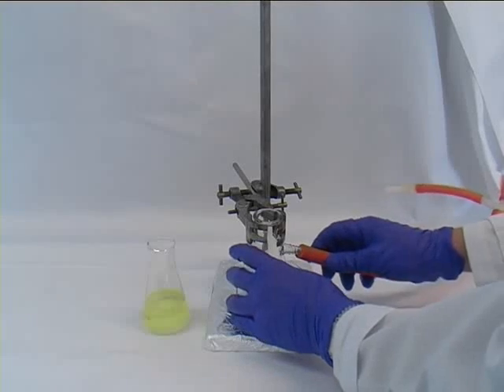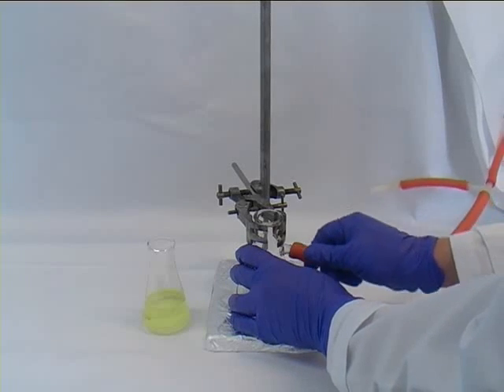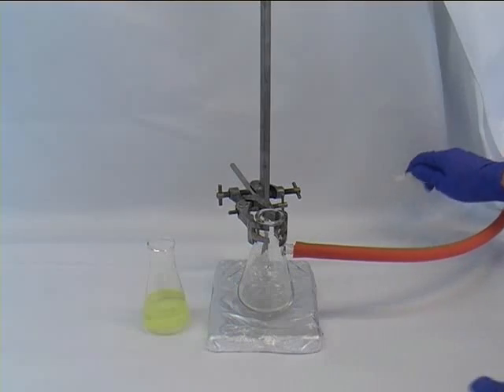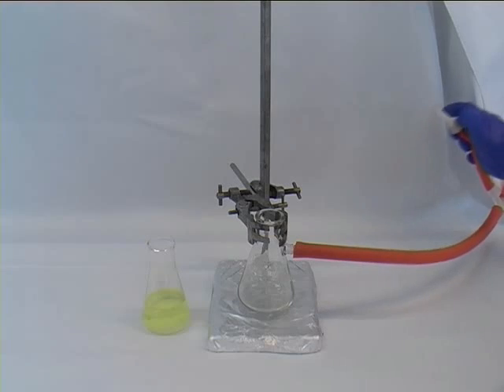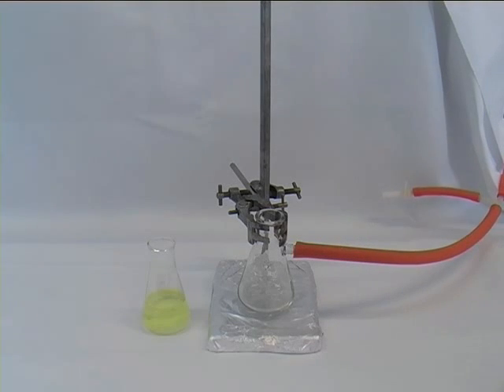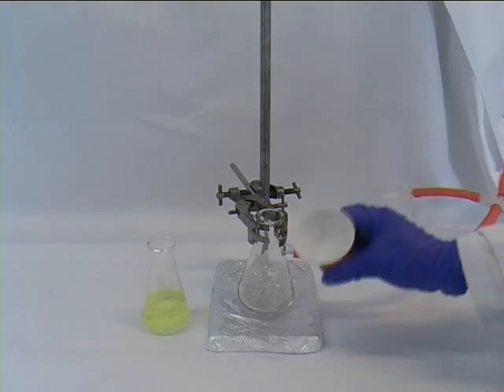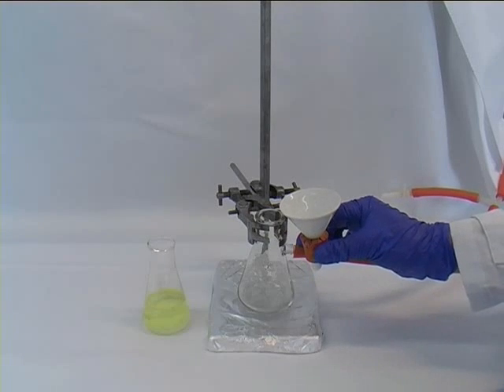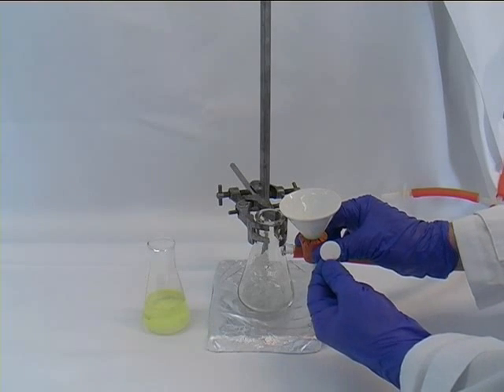The first one will be vacuum filtration, so you would be connecting the vacuum tubing, closing the white tab, and before you open the vacuum through the gray tab you have to put on the filter. We are going to be using a Hirsch funnel and a small filter paper.